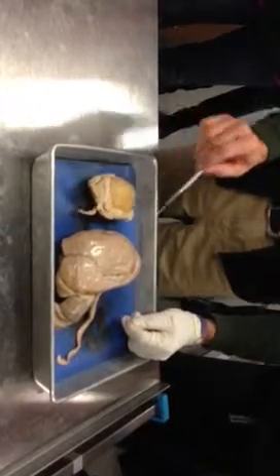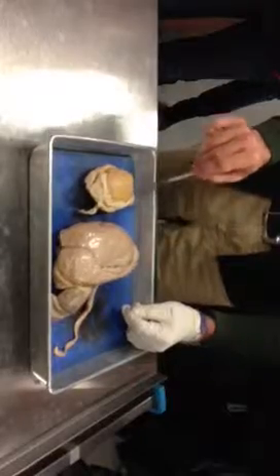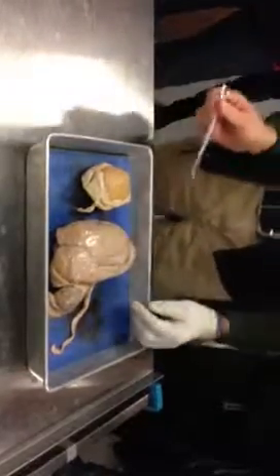The head of the epididymis. The body of the epididymis, and once again the tail down here. Again, the tail is pretty big anyway.